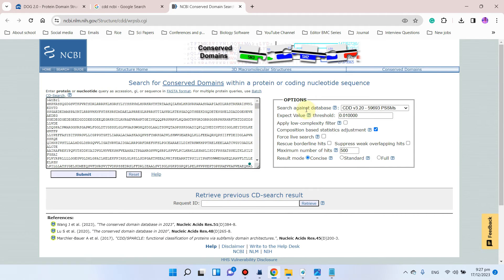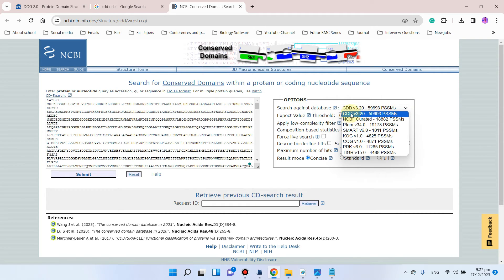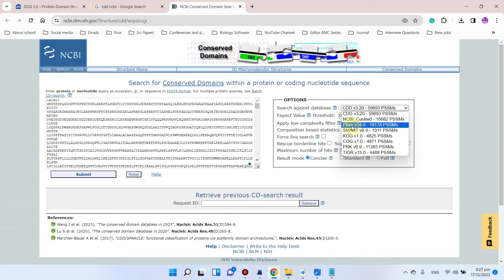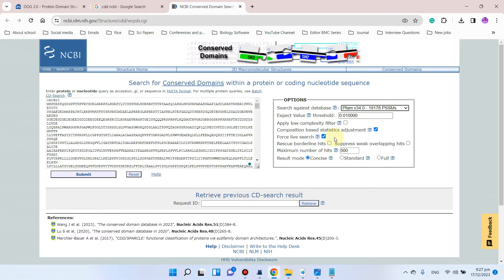Now it's time to choose a database to search against. There are different databases including CDD (Conserved Domain Database) and NCBI curated database. Since in previous videos we took domains from the pfam database, we will use pfam. For result mode, we'll go with standard rather than full — which creates too many results — and then click the Submit button.